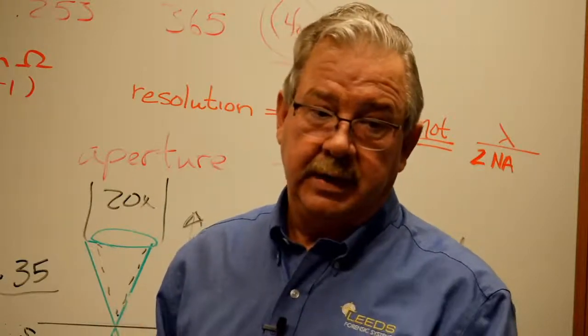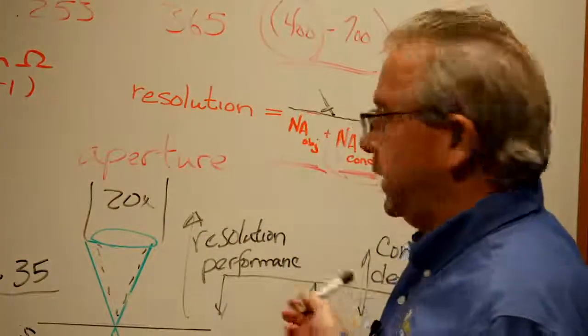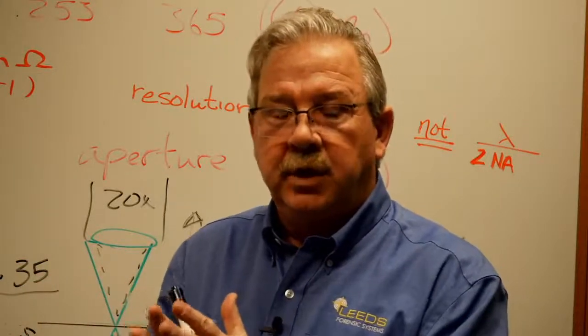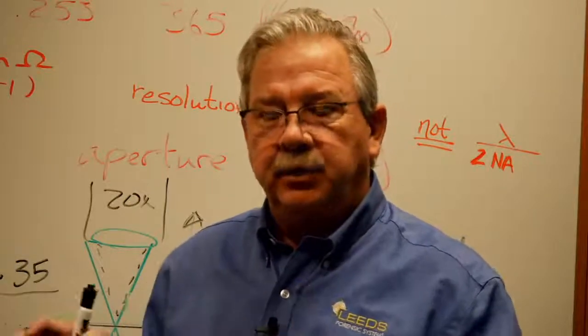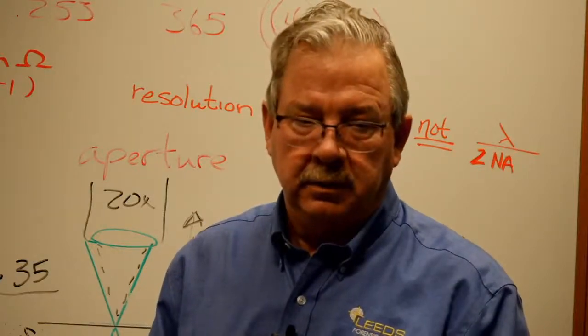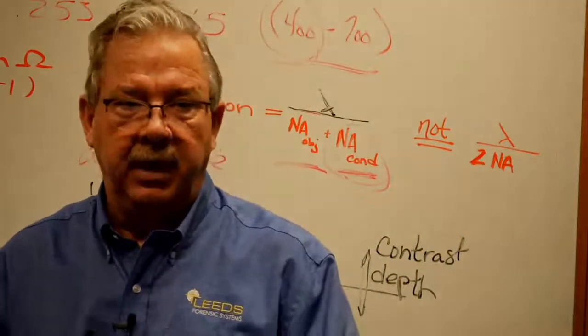If we were to do that same thing with a 40x objective, as I close that aperture diaphragm down, suddenly things that look sharp before start to look double-edged, start to look refractal. I just don't seem to be able to define that sample with the detail that I could when that aperture was open. So, am I suggesting to you don't use your aperture diaphragm?